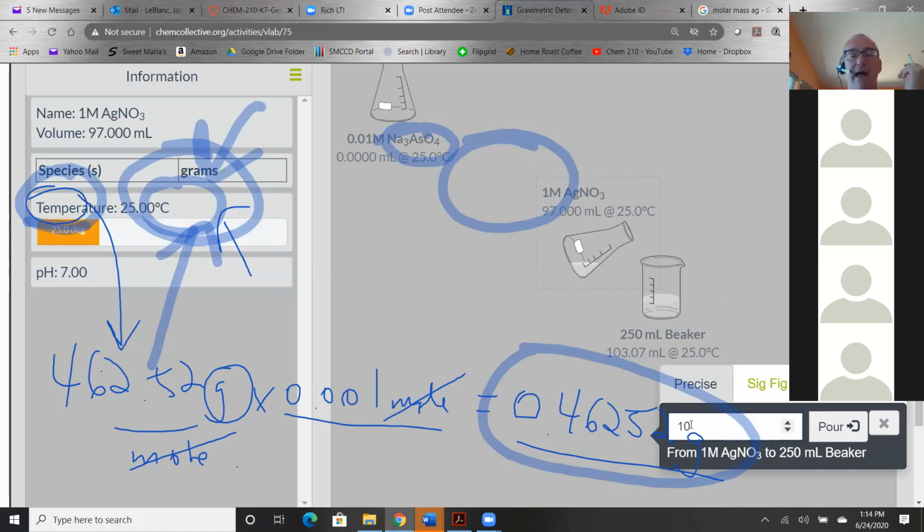What do you think is going to happen to the volume, to the mass of the precipitate? Is it going to go up some more? I mean, I'm adding more silver. The volume will go up. I'm sorry? The volume will go up. It'll go up? Yes. By how much? I mean, I'm adding a lot, so do you think it's going to go up a lot then, huh? Not a lot. Probably 10. Up by a factor of 10?